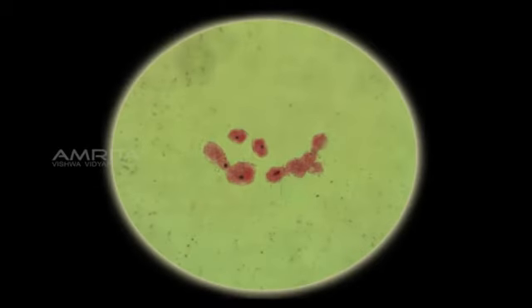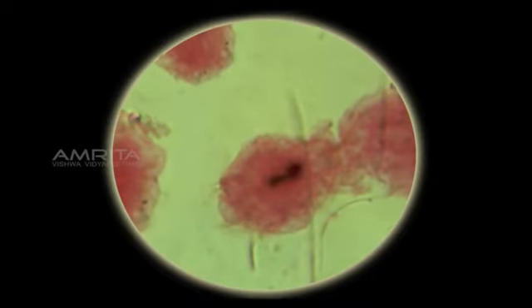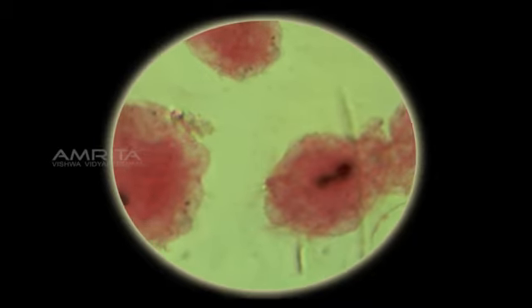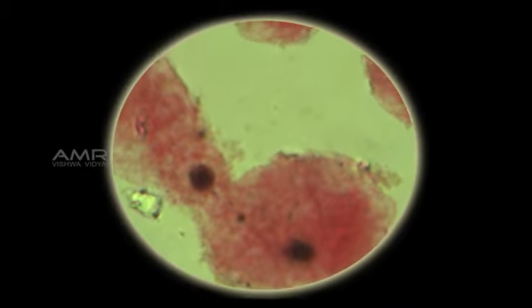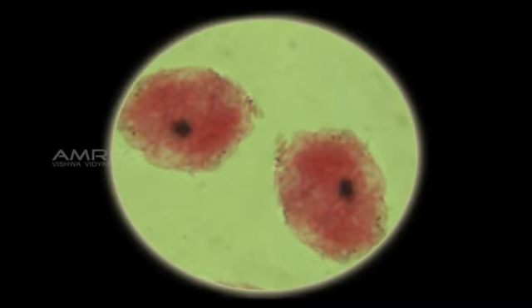Observations: we can observe that the cells of amoeba are irregular in shape. We can observe the process of karyokinesis, where the mother cell of the amoeba elongates initially and the nucleus divides into two. We can also see the process of cytokinesis that occurs after the nucleus has divided into two. Here the cytoplasm in the mother cell divides into two daughter cells. Our observation further shows daughter cells have a nucleus and their own organelles.